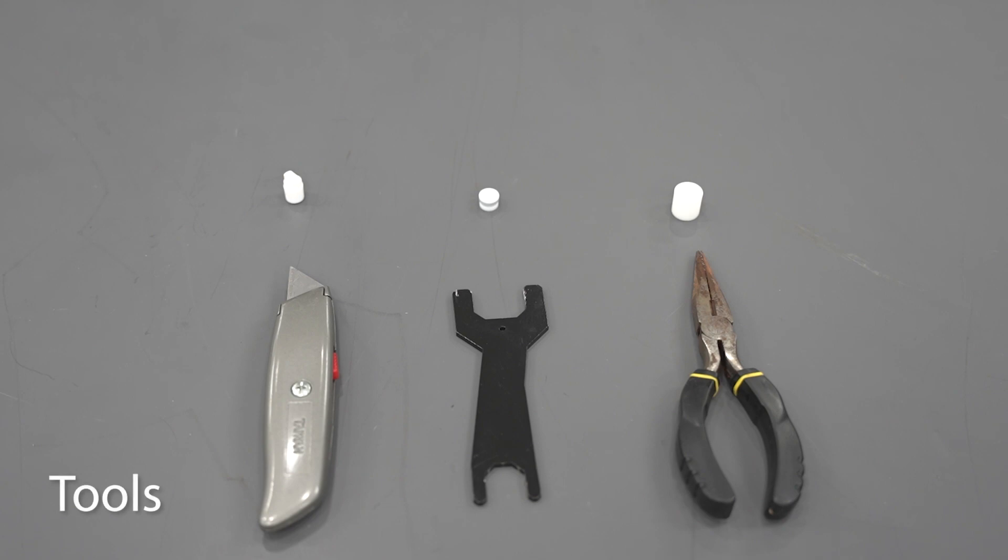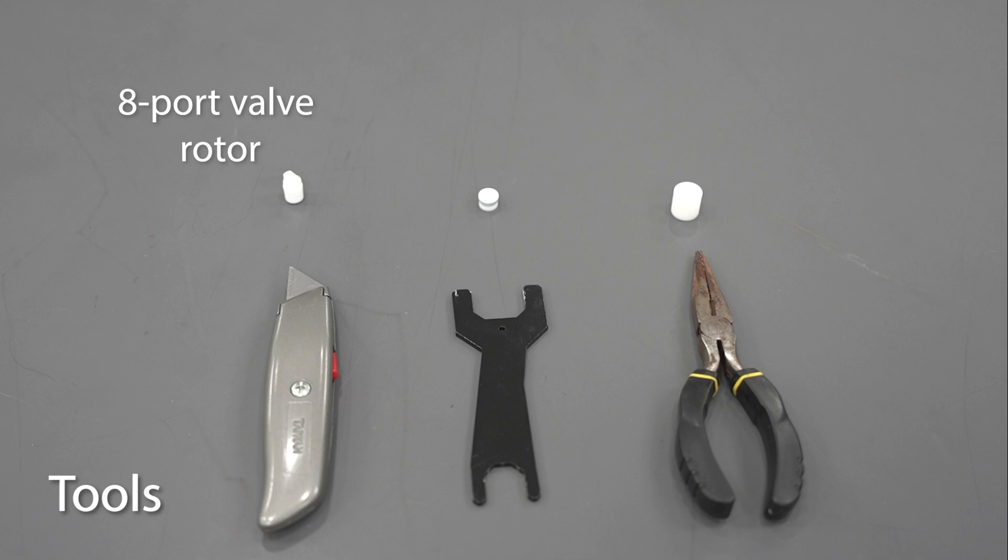To perform this maintenance, you will need the black double-sided wrench that came with the TOC as well as a pair of needle-nose pliers and a razor knife. You will also need a new valve rotor, a new syringe plunger tip, and the white jig that came in the box with the syringe.